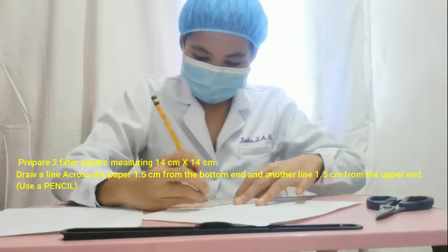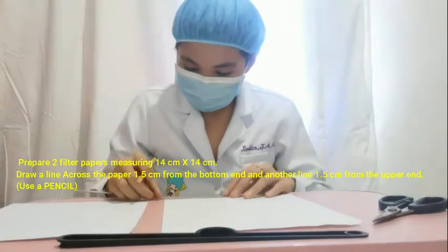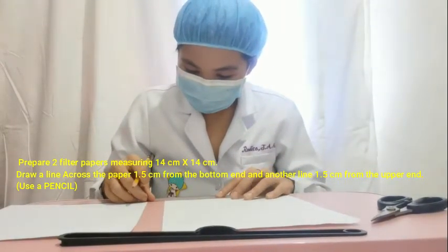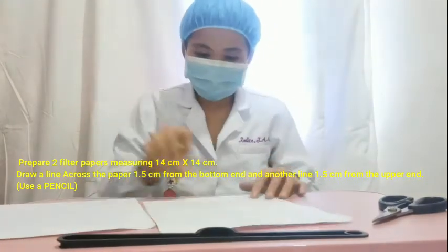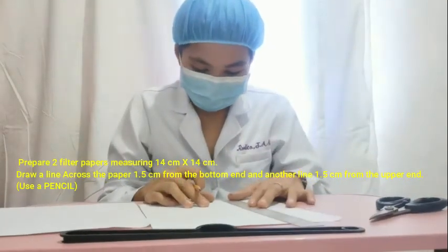Draw a line across the paper 1.5 cm from the bottom and another line 1.5 cm from the upper end.